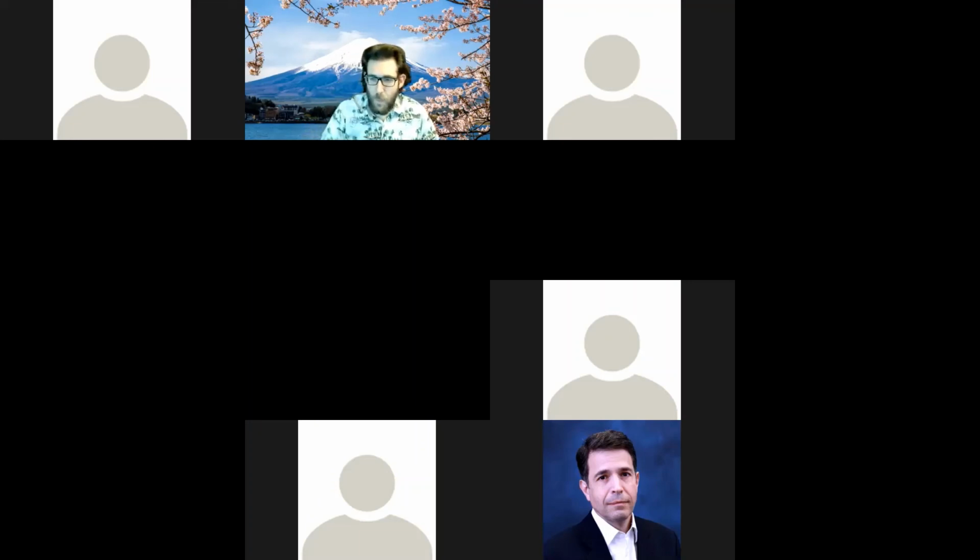I mean, it depends on which software you use for the GSEA. That actually is a long story by itself, either the standalone or the programming side. So it's getting a little lengthy to describe. So you may want to talk to Henry or maybe me at a different time. We can discuss more detail.